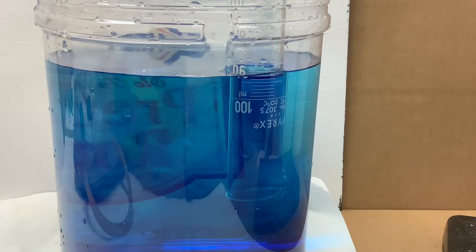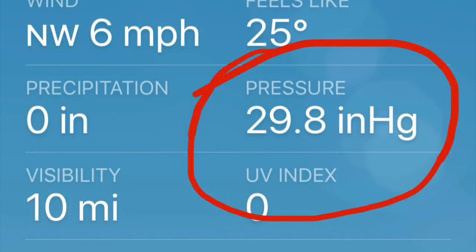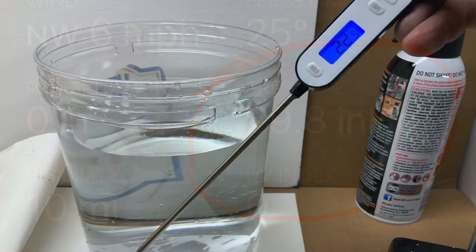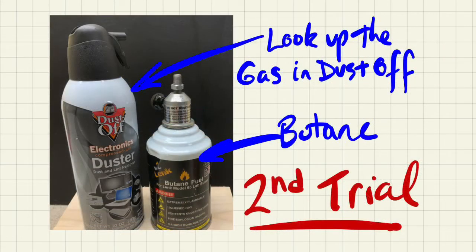So record just the pressure. It will be in inches of mercury. Don't record the temperature off the phone. Wait for the temperature on the thermometer. And we'll assume that the temperature is the same for the water and the room. And get your data table ready for a second trial.